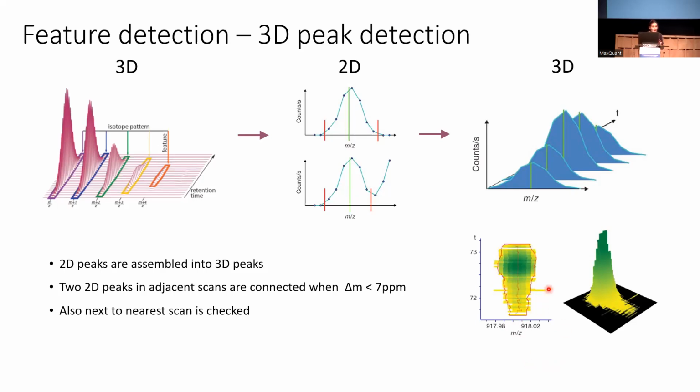It's not actually rectangular, it has this very irregular shape, which is very good in a sense that it will help us to be very precise. And if we have, for example, co-eluting peptides, this very big precision will help us. Another thing that you can check is that in the middle, the different centroids are grouped together.